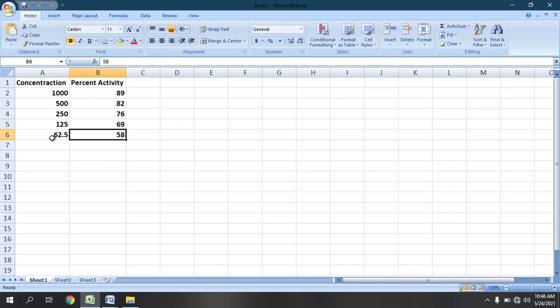In this example we can see that on the very lowest concentration the activity is more than 50 percent. The 62.5 ppm is showing more than 50% — that is 58% activity. So now we will learn how to calculate the IC50 values for samples which are having more than 50% activity, which are having very high activity. We are going to calculate the IC50 value.